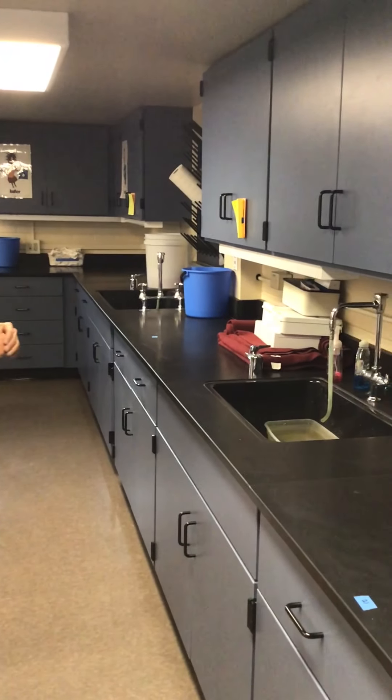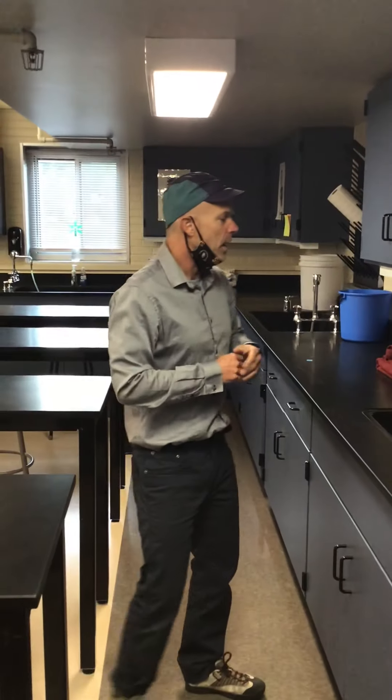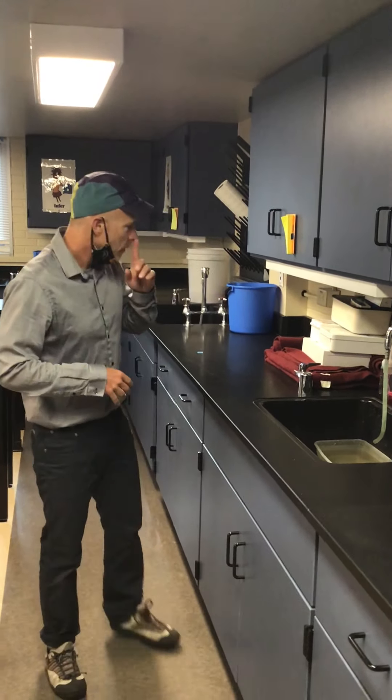Hi juniors. We're going to talk about the safety equipment in this lab. I first want to talk about the sinks. We have both cold and hot water in these sinks. The reason we mention sinks as safety equipment is that if you get chemicals on you, you'll want to first come to the sinks and wash those chemicals off.